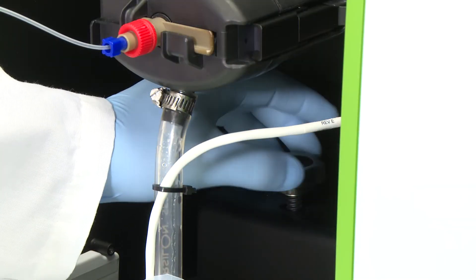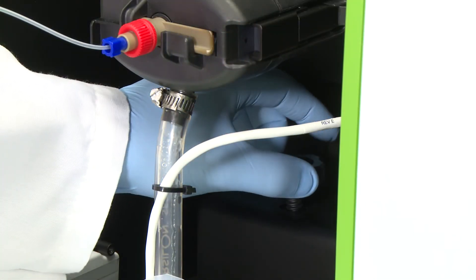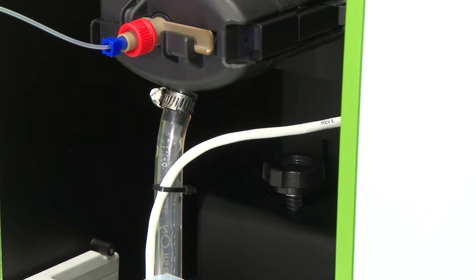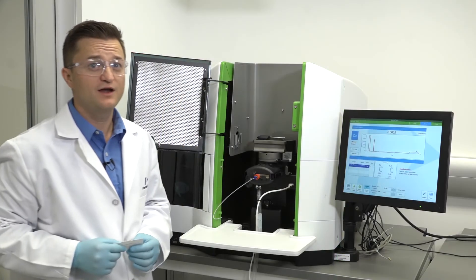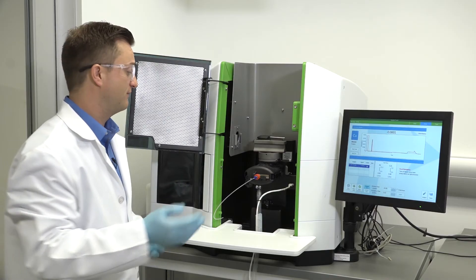Now, raise the burner with the vertical alignment control until the display indicates a slight positive absorbance reading of .002 to .004. Very slowly, lower the burner with the vertical alignment control clockwise until the absorbance reading returns to zero. Finally, rotate clockwise the vertical alignment control an additional half turn.